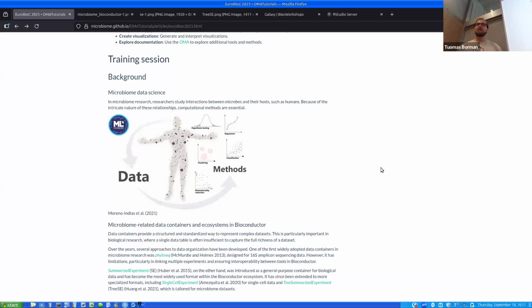That's the thing we do. And the sequencing data creates the basis of the analysis: what bacteria are present there. But nowadays, as I briefly mentioned, we usually also incorporate other omics, metabolomics, proteomics, or metagenomics, where you also get the functional annotations.